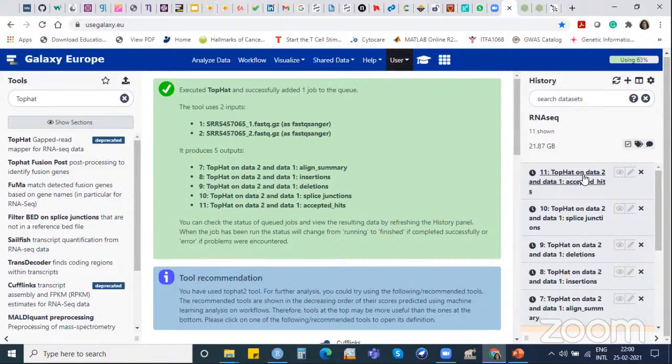So here I can do 2 types of analysis. I can see the transcripts, alternative splicing. I can do the transcript discovery. Any new transcript is formed or what is the quantity of it, that I can do, or I can do the variance analysis out of this data.